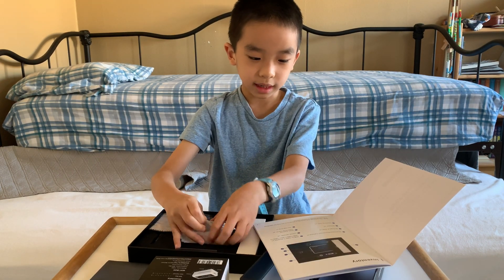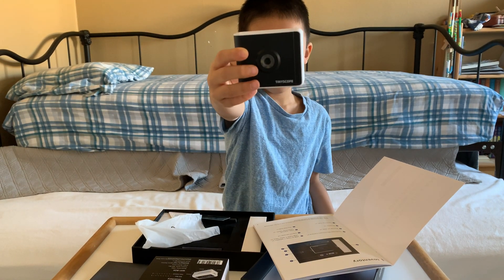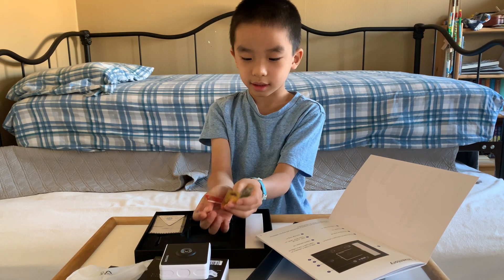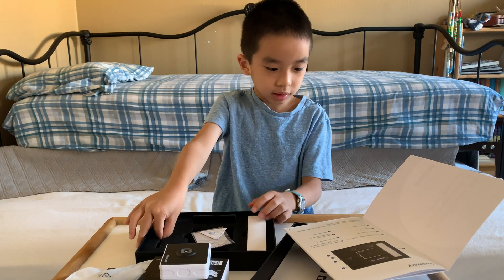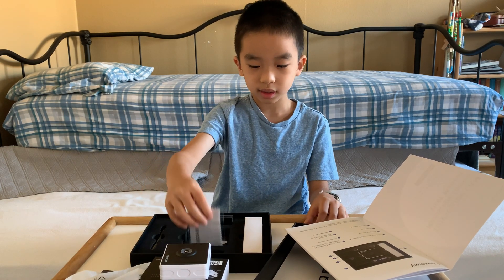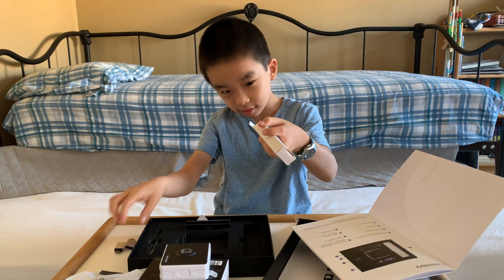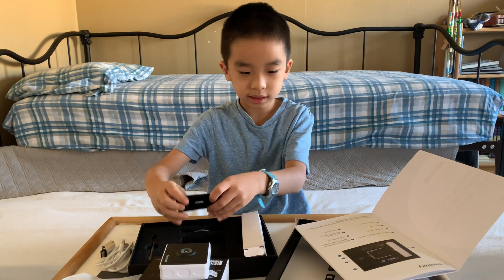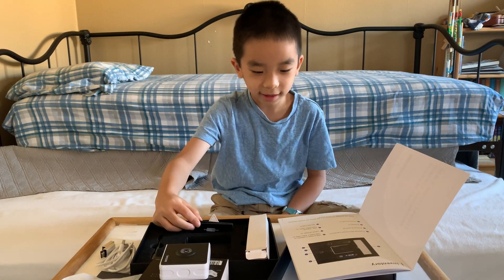First, there's one Tiny Scope microscopic camera. Number two, biology slide. And there's four bones. Then next is the dropper. Next is the cleaning cloth. There's also a plug, and these are the cables. These are the four liquid samplers. And number eight, storage bag.